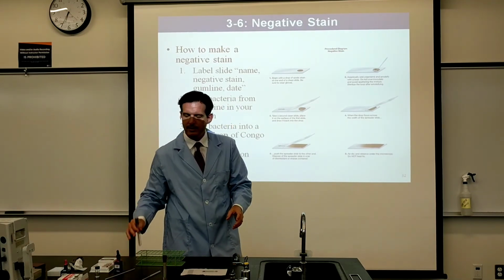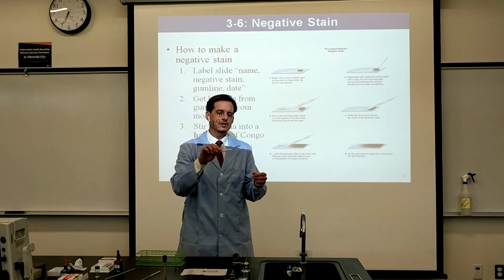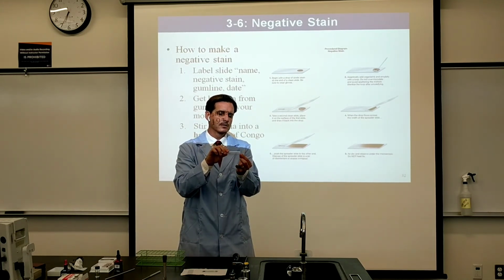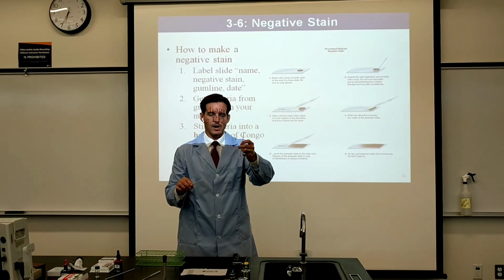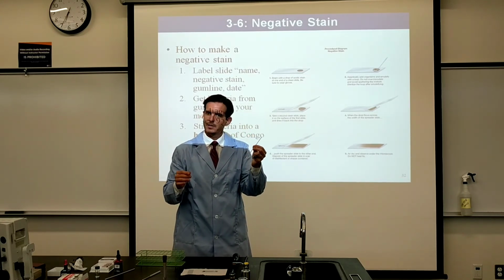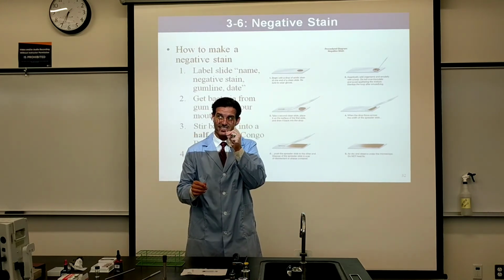And now what I'm going to do is use this sterile wooden swab as a toothpick. I have not been able to find the toothpicks, but I promise this will do the job as well. So here I am, digging between where my teeth meet, up the gum line.